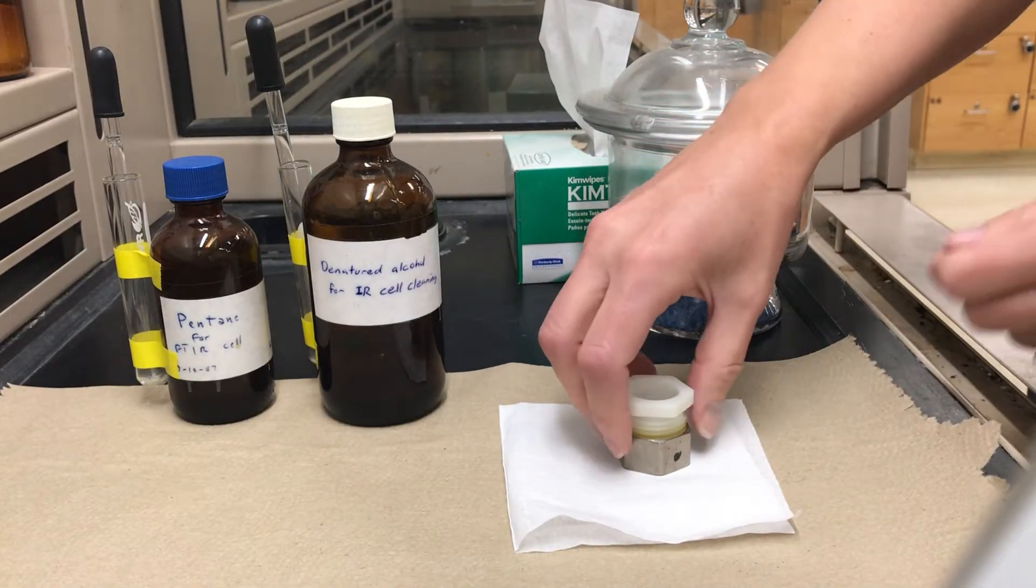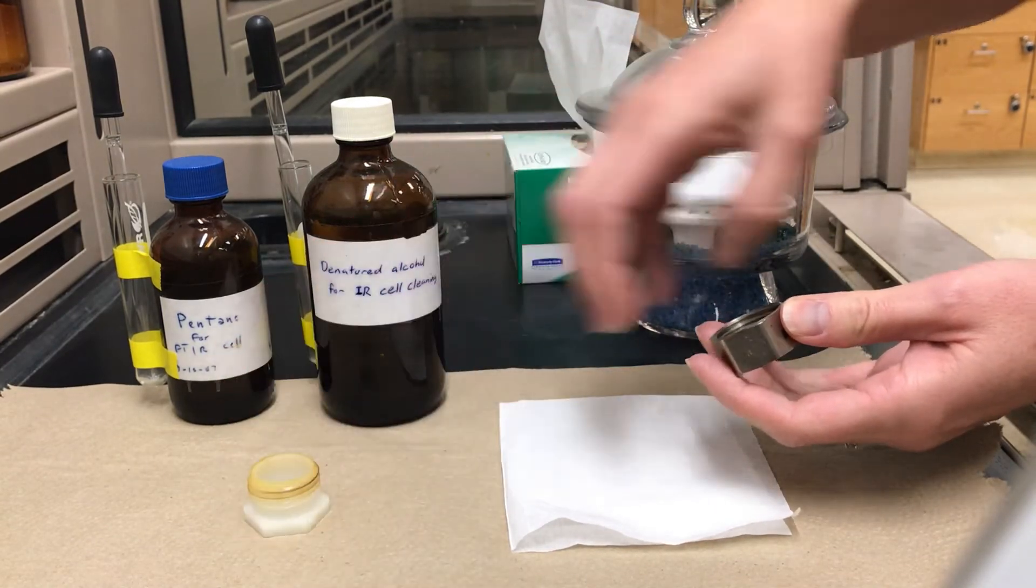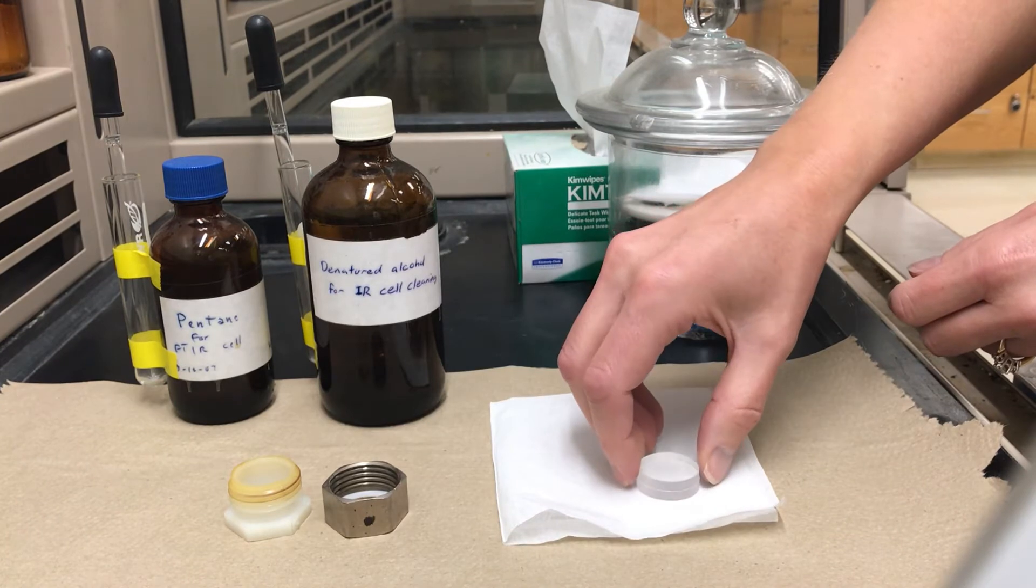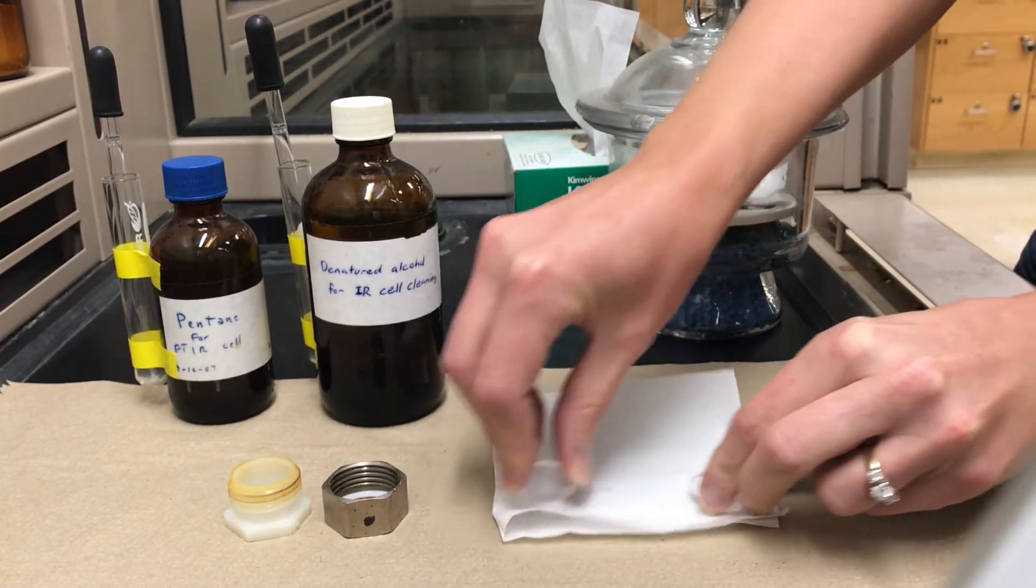When you're ready to clean the plates here's what you'll do. You'll first open up the holder and remove the plates. You can just pour them onto a kim wipe and then open up the sandwich and then take the dirty sides and wipe those onto the kim wipes.